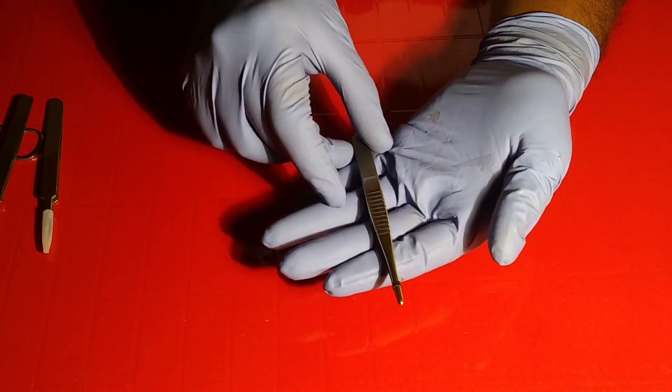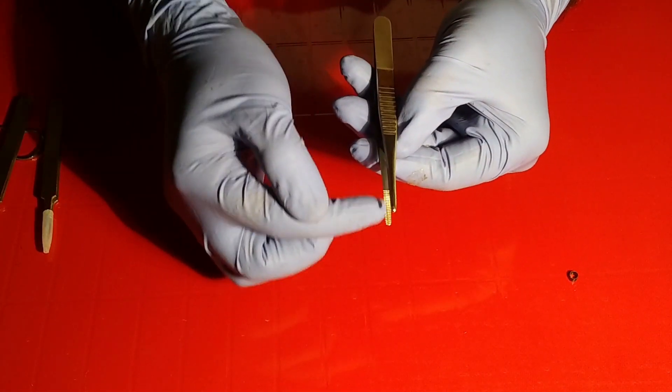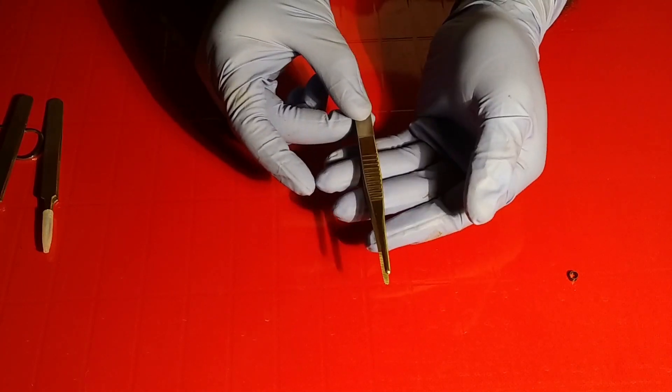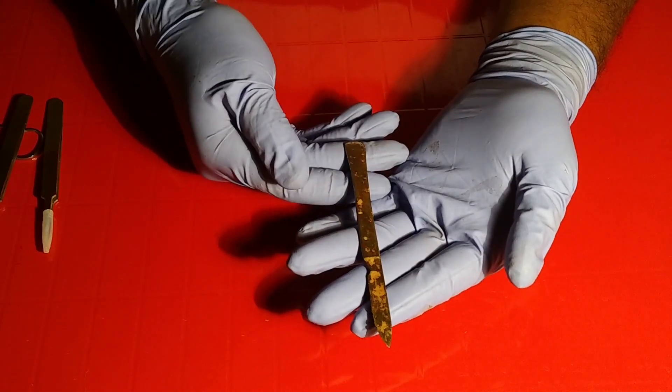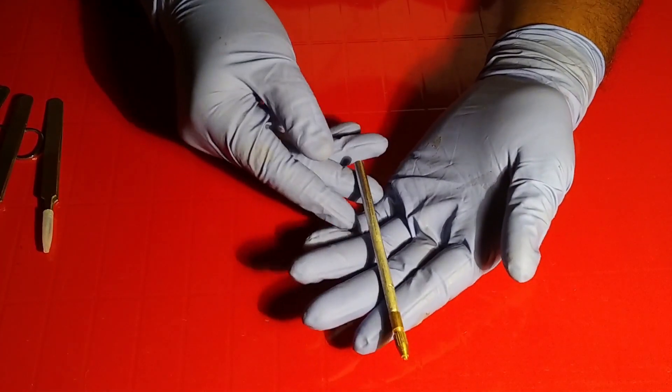This one is the vertebrate forceps, having a very distinct transverse ridge in the inner portion. Clearance of muscles or other body parts for vertebrates will be very convenient with this. A scalpel helps to clear out muscles or body parts. Next one is the needle holder.